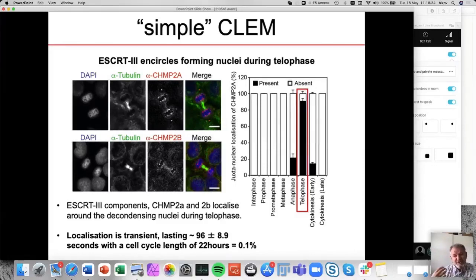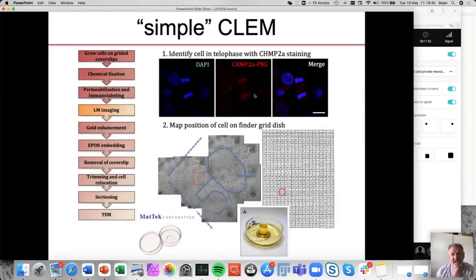So if we would just start doing electron microscopy on that, we could search for days to find that particular cell. So we're going to use an aid. And so we have the fluorescence, which tells us, okay, the protein or the protein complex is currently located at that position.